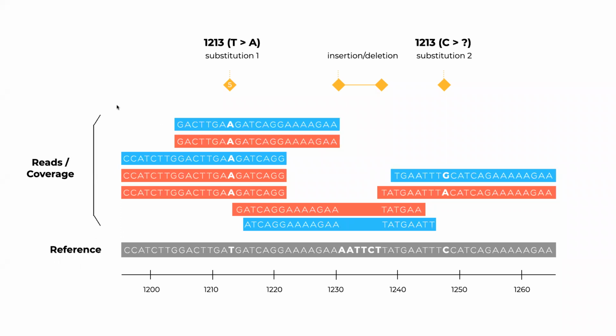As we saw in these examples, in reality, we deal with something that looks like this. We have a number of reads, which is called coverage. We have a reference sequence where we have the nucleotides in each position on the reference genome, and we're trying to look for variants. Those are going to be different types of variants: substitutions, insertions, and deletions. So when we have a situation like this, where we have 1, 2, 3, 4, 5 reads that all contain a change from the reference, we're going to be fairly certain that this is a substitution, and we can mark it as a substitution.